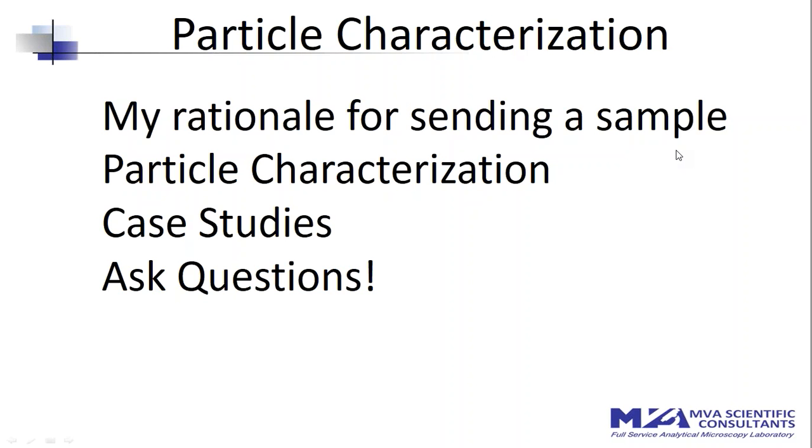Finally, I'll get a report, and at that point, I'll have a chance to read the results, go through the results, and at that time, I'd like to call the lab again and say, I've looked at the report. Can you explain or clarify this point, or is there anything else as we go through the report, or just discuss in general terms what the report means? Does anything else come up where we have to do more work, or are we done? Do any additional tests come out of that conference? All these things are very important to me as I investigate a particular problem.